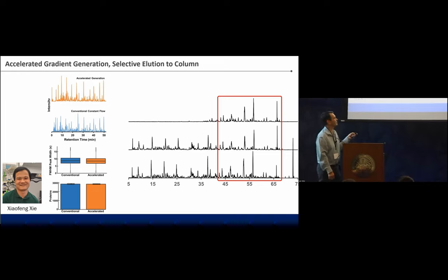So essentially, if you're running your separation at a low pressure, you're leaving some separation performance on the table, is my opinion. So we're running the whole thing at the highest pressure our system can handle. So there's no more room to go up. That's a bottleneck, I see. Yeah. We're already kind of as high as we feel our fittings and pump can handle without a lot of headache. But that's exactly, you should work for Thermo because that's what they do. Yeah.